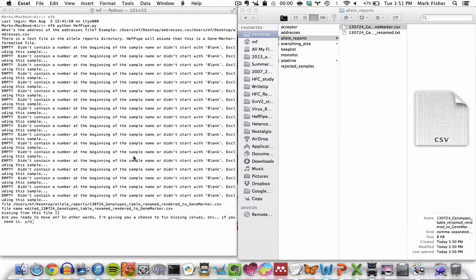So you could just run the pipeline exactly the same way using GeneMapper formatted files as you could using GeneMarker formatted files.